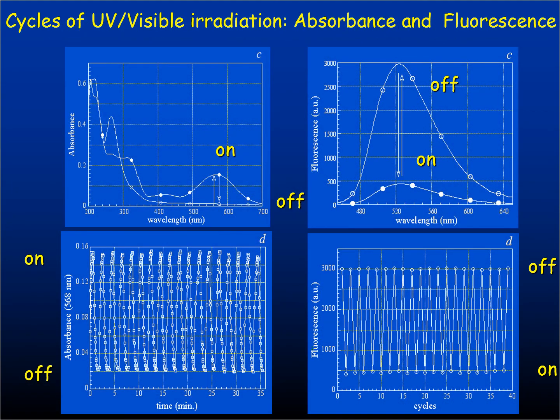You can then make measurements repeatedly by switching the acceptor back and forth. So it's as if we could repeat the acceptor bleaching experiment many times, and you can then be really sure that no photo conversion or something like this is going on with the donor to explain the changes in lifetime.